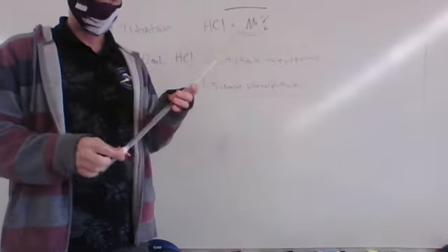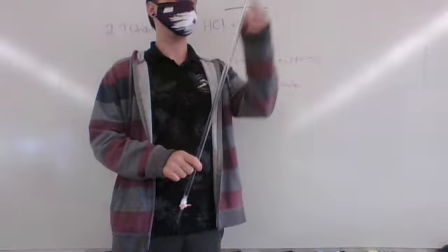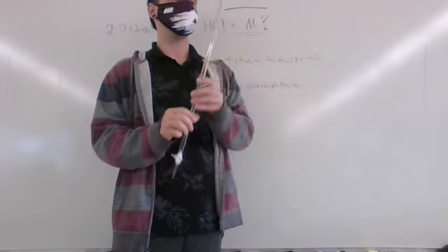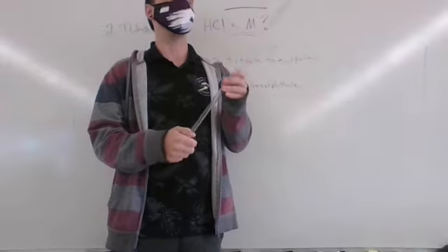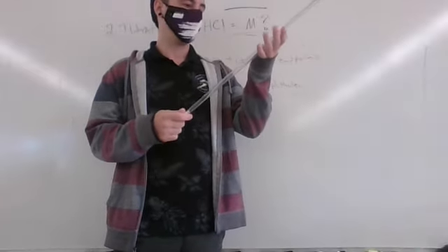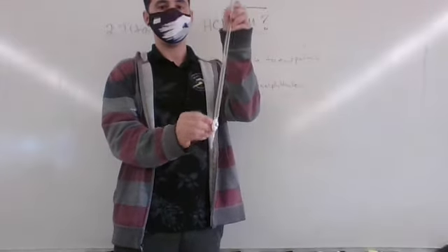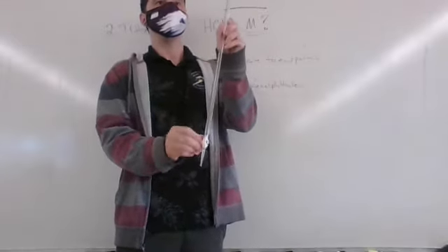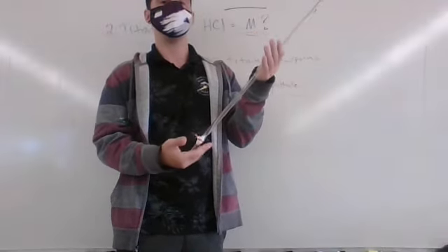You remember? Just remember when you're filling the burette, you want to rinse it first with whatever you're titrating. These are clean right now, so you don't need to rinse it with water. But you just rinse it with a little bit of whatever you're titrating. Let it all drain out, and then put your new titrant in there. So you're going to be filling this with NaOH.